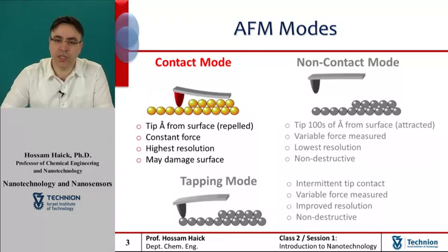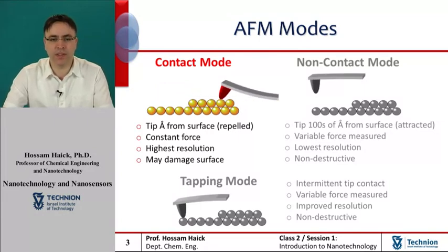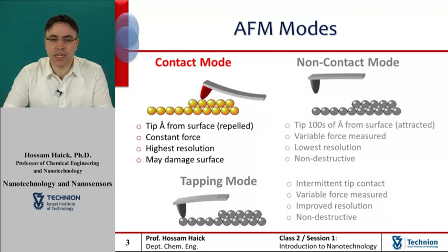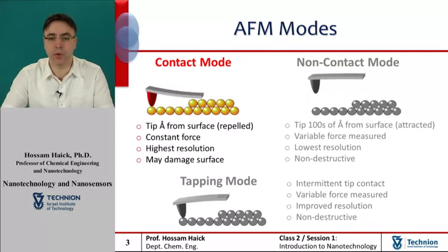In the static mode operation, the static tip deflection is used as a feedback signal. Because the measurement of the static signal is prone to noise and drift, low stiffness cantilevers are used to boost the deflection signal. However, close to the surface of the sample, attractive forces can be quite strong, causing the tip to snap into the surface. Thus, static mode AFM is almost always done in contact where the overall force is repulsive. Consequently, this technique is typically called contact mode.